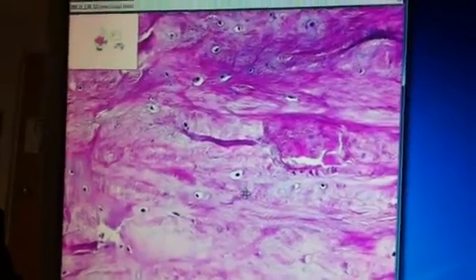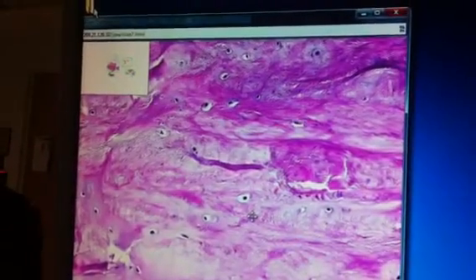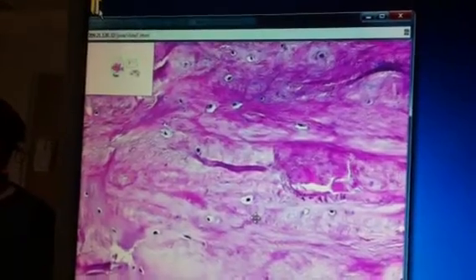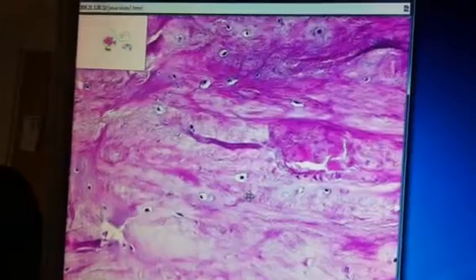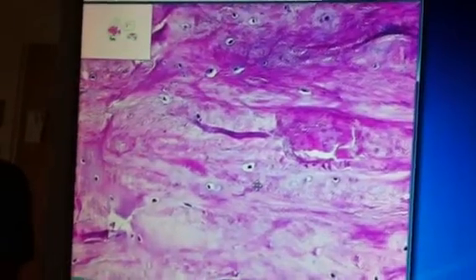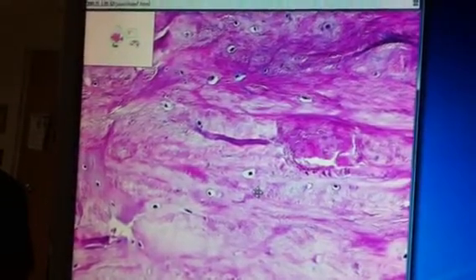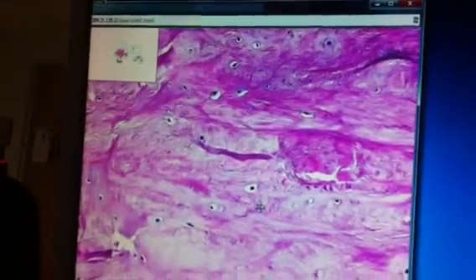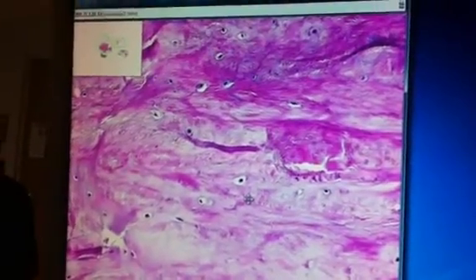I could also say what type of fibers are present in this connective tissue. Type 1, okay? And I could say, does this connective tissue have a perichondrium? No, because you can identify that it's fibrocartilage, so you should know it does not have a perichondrium.